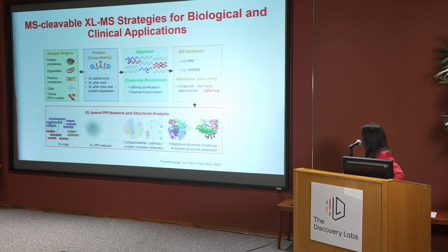We can also work on intact cells. And recently, in collaboration with Hui Zhang's lab at Johns Hopkins, we started to study protein-protein interactions in PDX models and cancer patient samples through the CPTAC project.